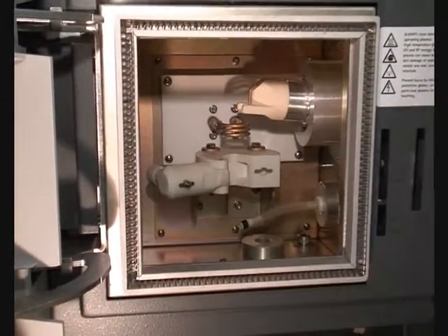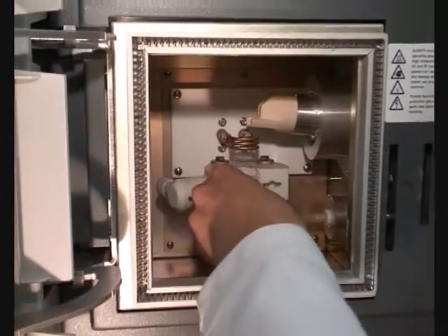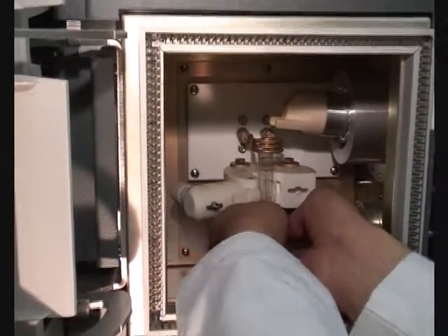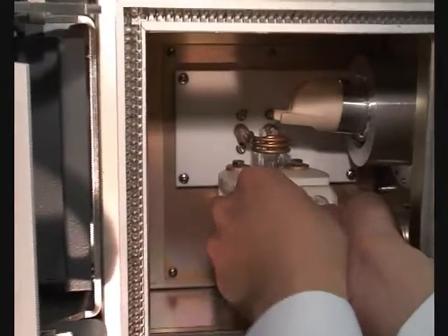Release the torch clamp and swing the clamp arm clear. Ease the top end of the torch up through the induction coil, then close the clamp.